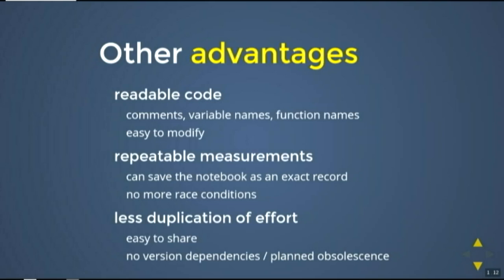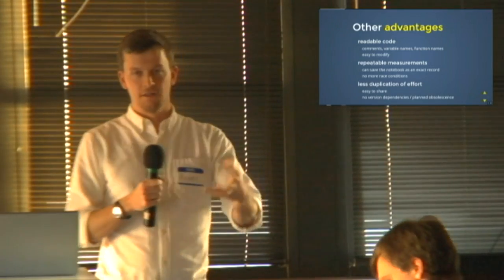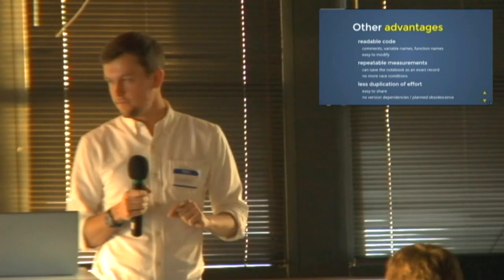Since this is scientific research, it's really important that we be able to repeat what we did, and that is baked right into the notebook format. If I'm doing an experiment, I can take each measurement in a new cell, save the notebook, and that is an exact record of what I did. So if I need to go back and do it again, duplicate my results, I just load up the notebook, run all my cells, and that is guaranteed to be exactly what I did last time.